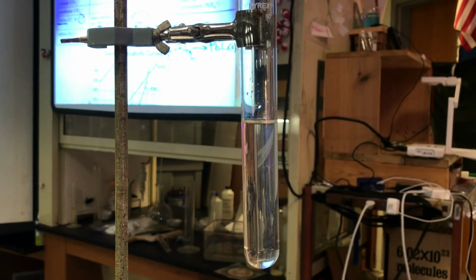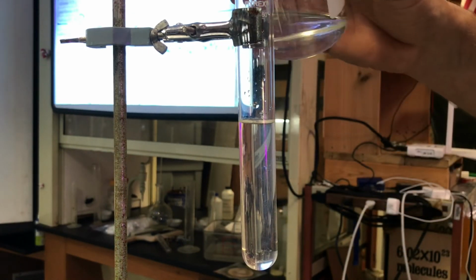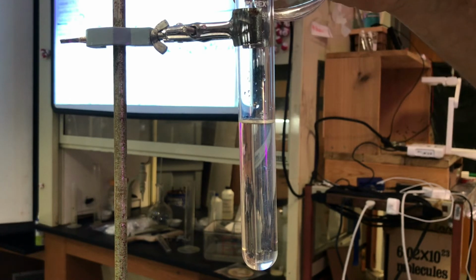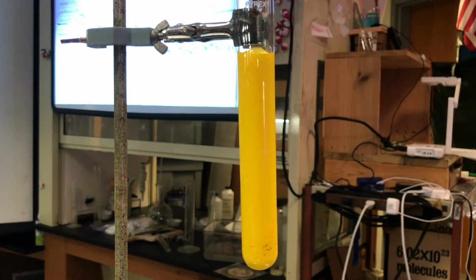So let's do this. Now I'm going to add the K+ ions, but more importantly, the iodide ions in here. And I'm going to add them to the lead, and I'm going to precipitate. So let's do that. Ready? 1, 2, 3. Did I make a precipitate? How do I know I made a precipitate?